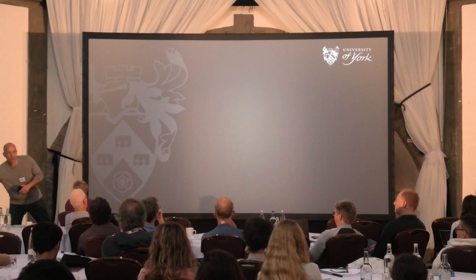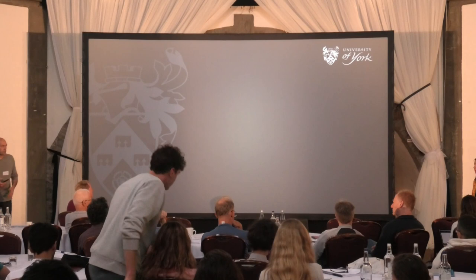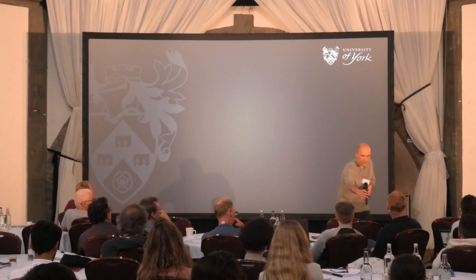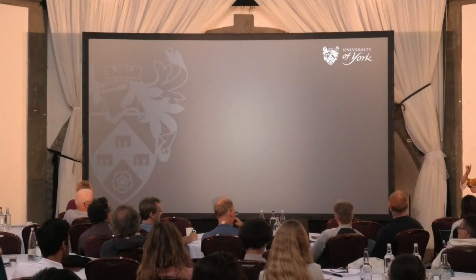Nice talk. Did you have any sign of a spike on this protein? The spike? Not really. When we did the reconstruction, we observed a little bit of a spike, but it's more similar to a fiber of adenovirus. But right now we are not focused on the vertex, but we will try to do a focused reconstruction only on the vertex to see this kind of possible fiber.